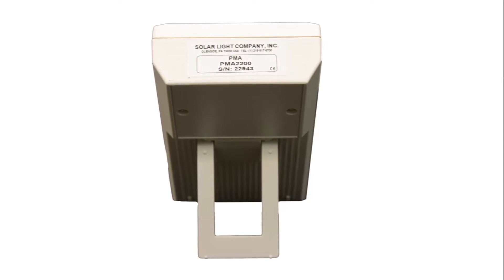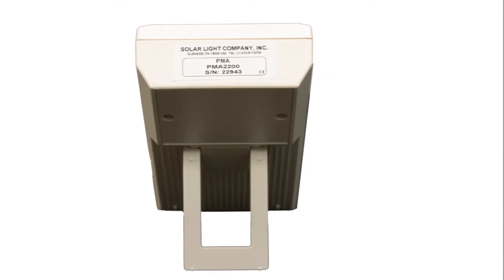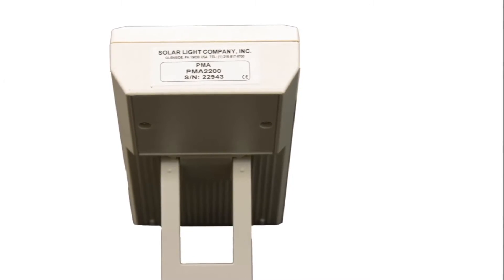The portable PMA2200 meter is powered by four AA alkaline or NiCAD batteries, and a power supply is also included for laboratory use. The sensor output algorithm provides precision readings, choice of units, and date of calibration. Instant values, such as power, can be time-integrated to also show energy.